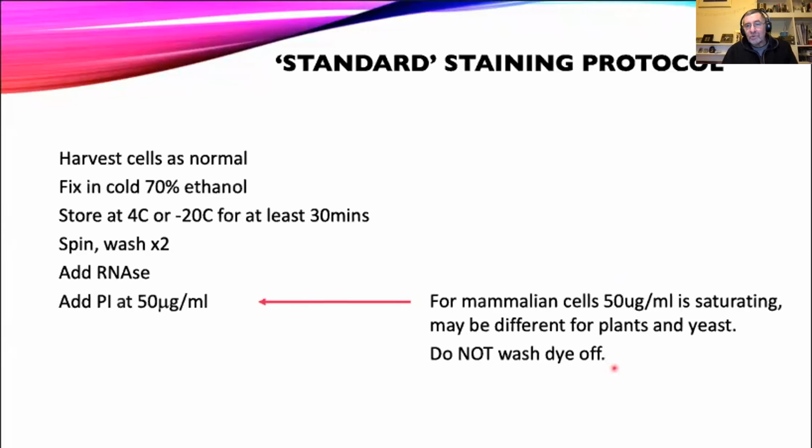Importantly, we shouldn't wash this dye off. Those dyes are not binding covalently to DNA. And if we wash them after the staining, what will happen is we'll start getting equilibration of the dye. It will start leaving the DNA. So again, that will contribute to the data spread. So we're going to run our samples today in the staining solution.